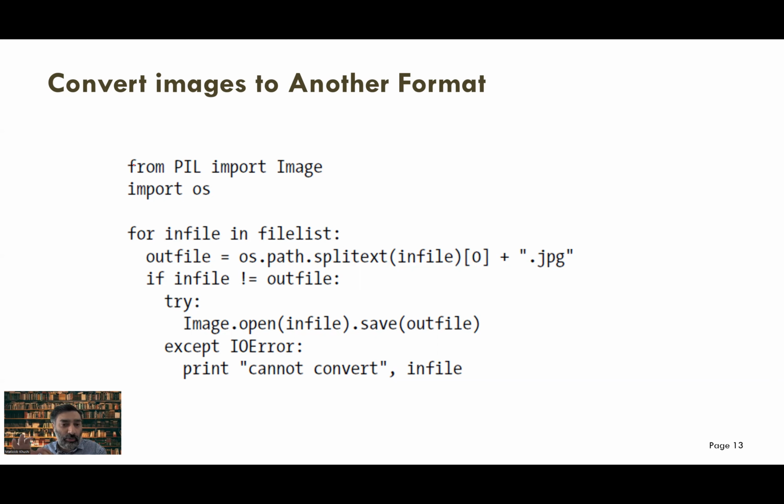Because processing on original TIFF images takes ages. So you'll be wasting lots of your time and computing power. For me, it always worked well. Whatever I designed on the smaller size JPEG images worked well on the higher TIFF images as well.